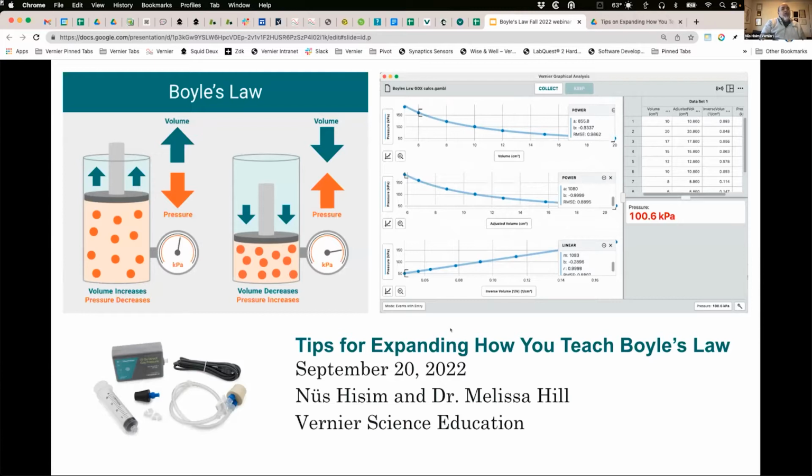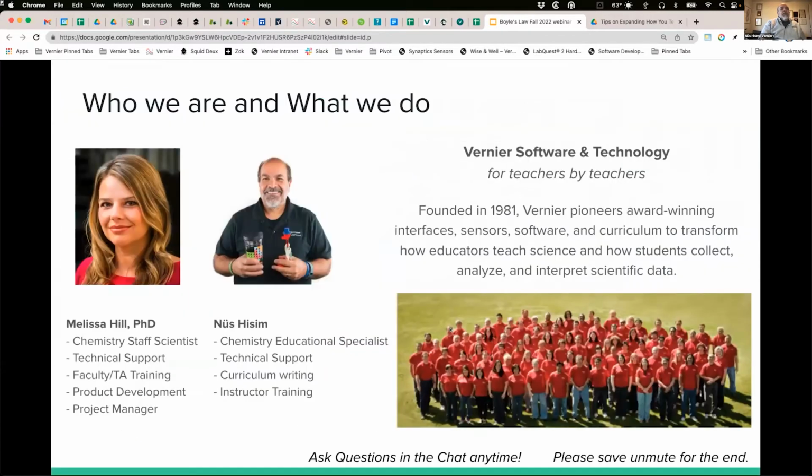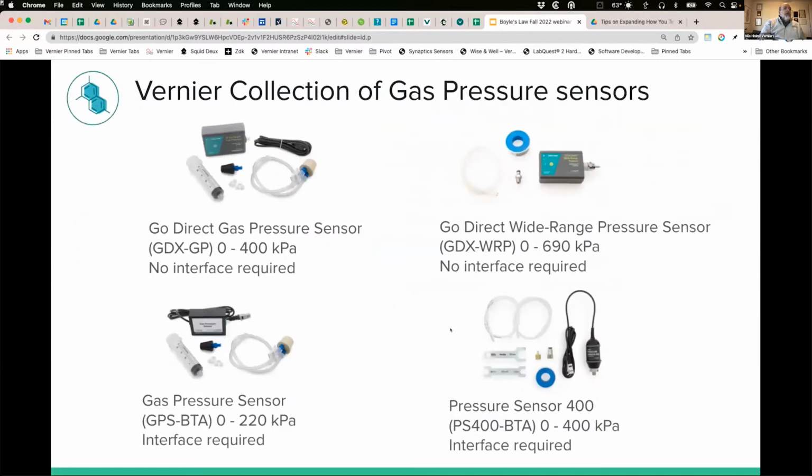Put it on your phone or a tablet or something that you're not watching the presentation on, and you will get to play along. You're going to get live data from me, and then we'll analyze it together and we'll look at some of the features of GA.